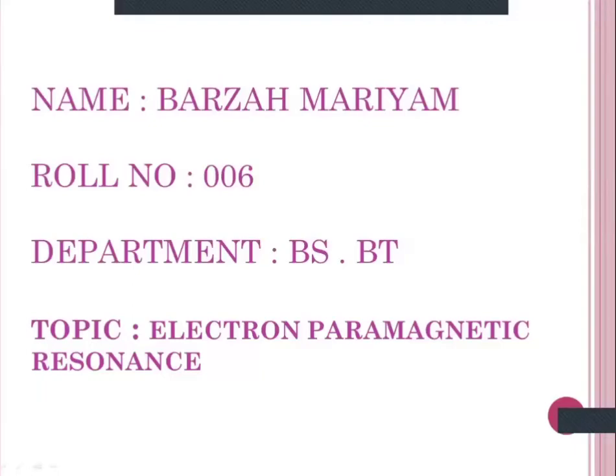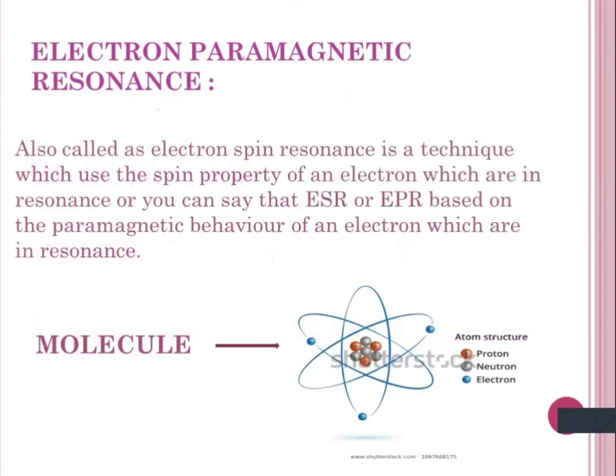My name is Birza Mariam from the Department of BS Biotechnology, and the topic of my presentation is electron paramagnetic resonance. It is a technique which uses the spinning property of an electron, which are in resonance, or you can say that electron spin resonance or electron paramagnetic resonance, based on the paramagnetic behavior of an electron, which are in resonance.